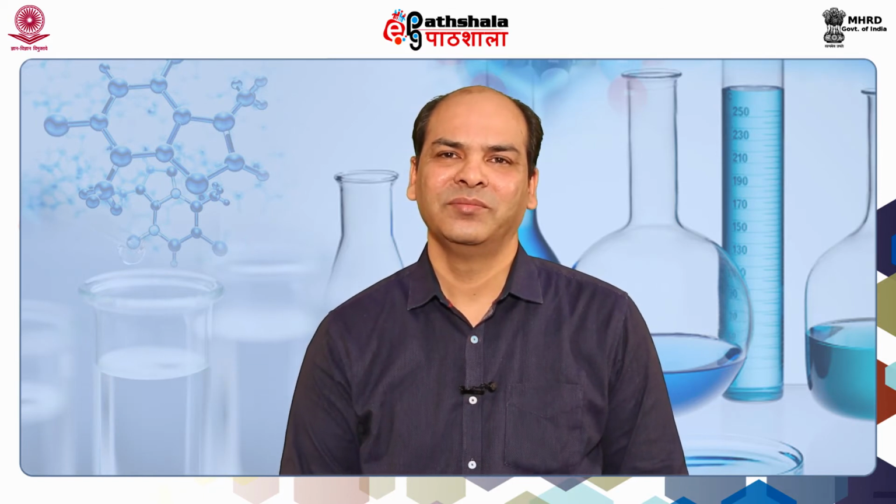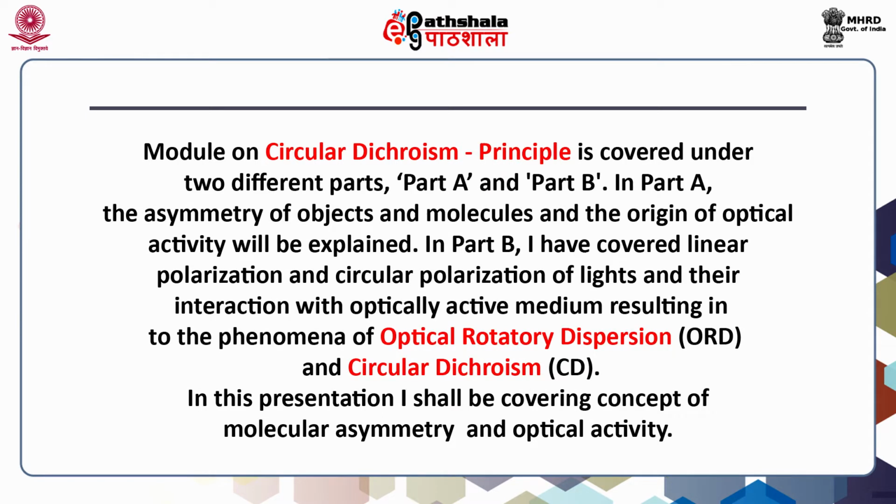The module on circular dichroism principle is covered under two different parts, part A and part B. In part A, the asymmetry of objects and molecules and the origin of optical activity will be explained. In part B, I have covered linear polarization and circular polarization of light and their interaction with an optically active medium, resulting in the phenomena of optical rotatory dispersion and circular dichroism. In this presentation, I shall be covering the concept of molecular asymmetry and optical activity.